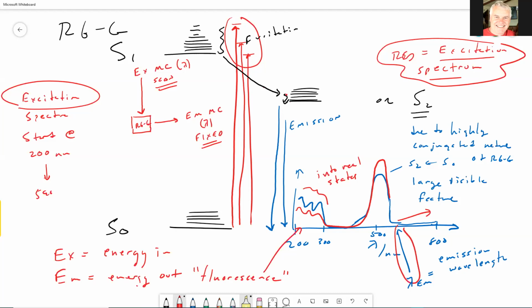And that in itself is just a fascinating area of study because sometimes you can see the molecule changing, like if you have the molecule embedded in a plastic, for example, and the plastic is near its glass transition state, it's warm enough that it's just slightly liquidy, then you can see the fluorophore tumbling.